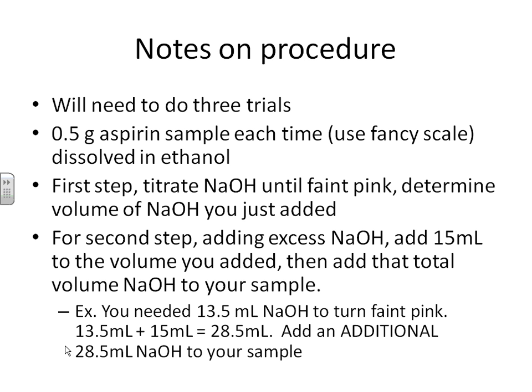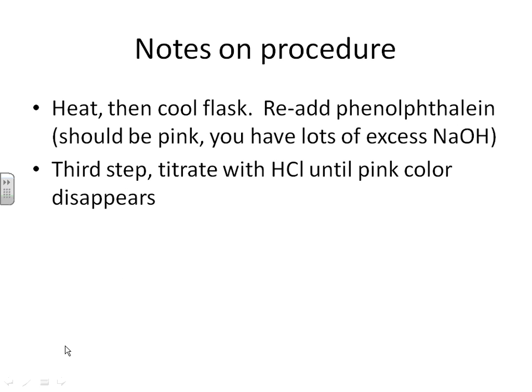So at this point, we've got just shy of 45 milliliters or so of sodium hydroxide added into the flask. It is adding a lot of NaOH. That is the point. That's how we hydrolyze the aspirin. For the next step, after you add the excess sodium hydroxide, you heat it up in a hot water bath and then you let it cool down. There's a lot of that in organic chemistry, which is what we're doing. This is an organic chemistry lab. A lot of heating and cooling and kind of waiting around.